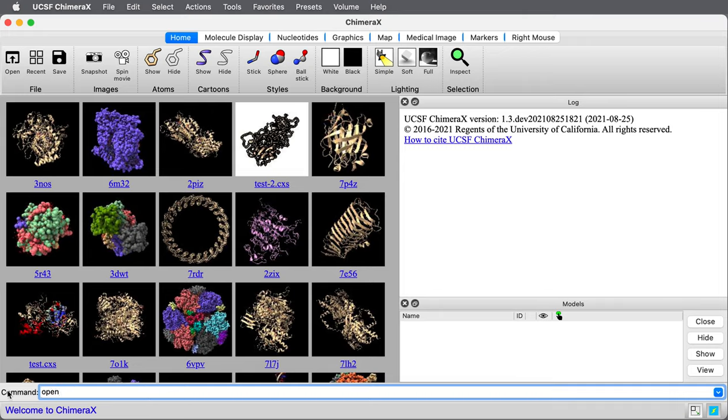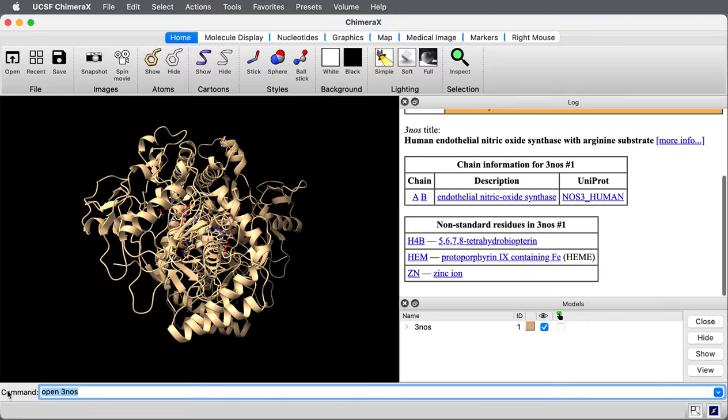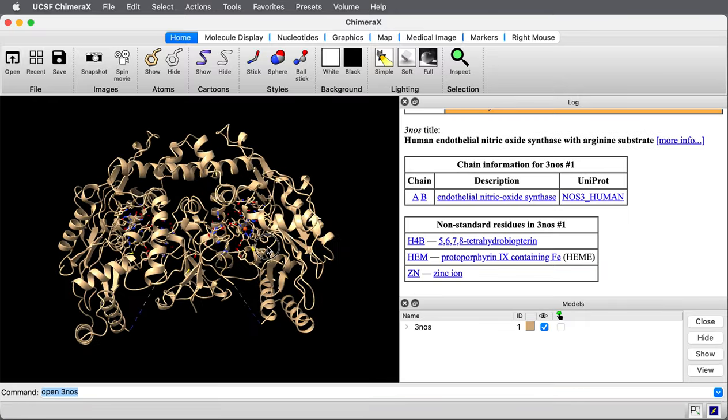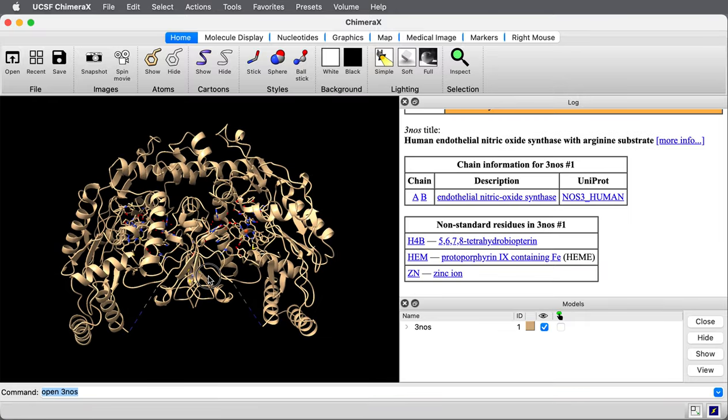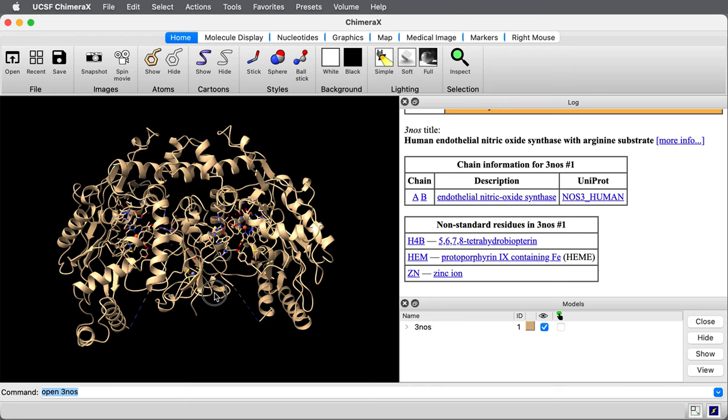The PDB-ID code is 3NOS. It's a dimer. Here's what it looks like.